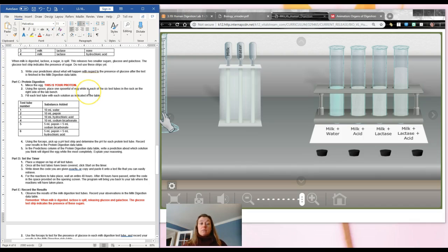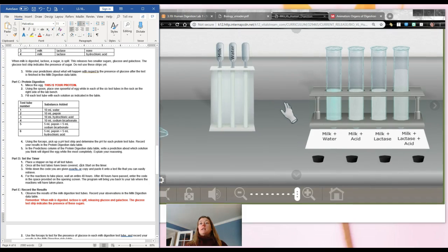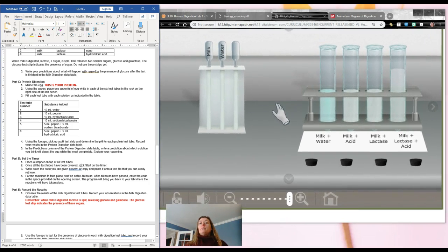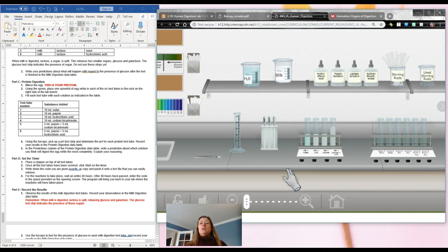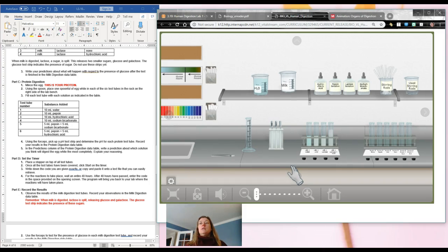That's the egg. Remember, if you've ever heard the expression that bodybuilders eat a lot of eggs, oh, that's ugly. Don't do that. That's because there's a lot of protein in eggs, and bodybuilders like to have a lot of protein in their diet so that they build big muscles. Oh my goodness, this is making me nauseous. Let's get this a little smaller. Sorry about that, guys. I know I'm neurotic about the little things.